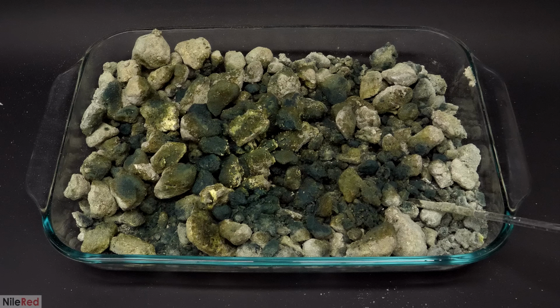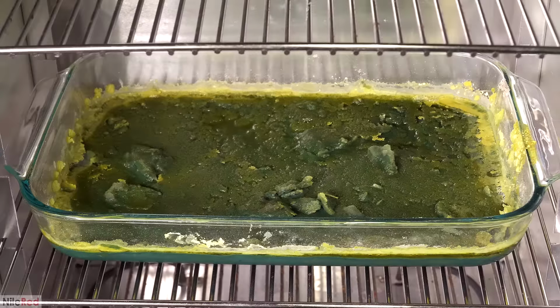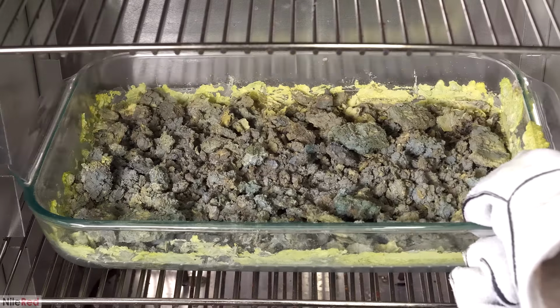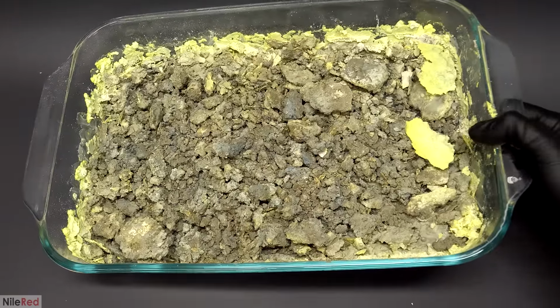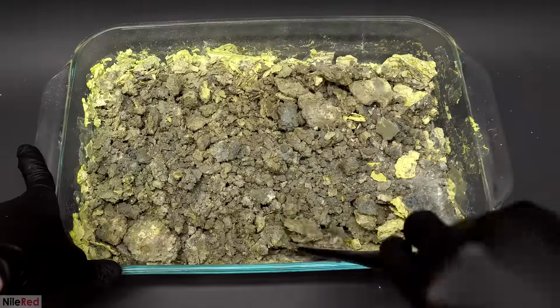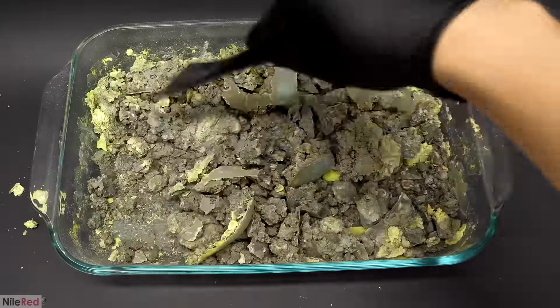This was actually pretty easy to do though, and I just put it all into an oven at around 90°C. Very quickly, it all started liquefying, and over the course of a few hours, I was able to completely dry it. When I felt that it was done, I took it out of the oven, let it cool down, and scraped it all off the dish. Without any water, the volume of it was a lot less, and it also didn't weigh as much, and I was able to pack it into a much smaller bag.